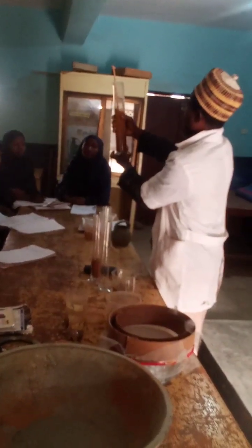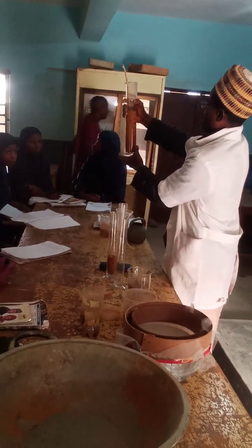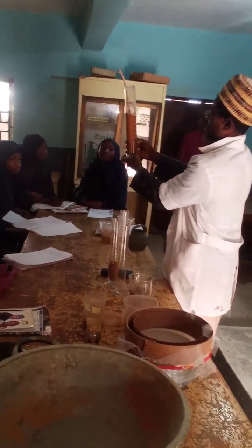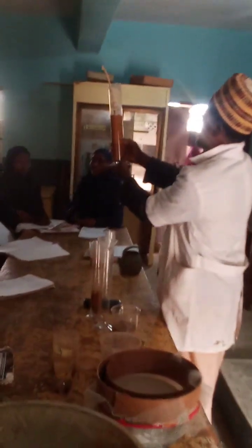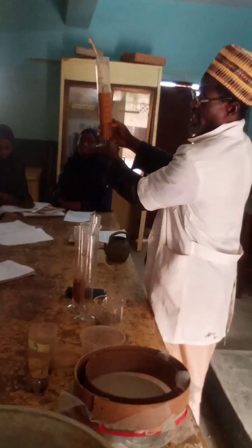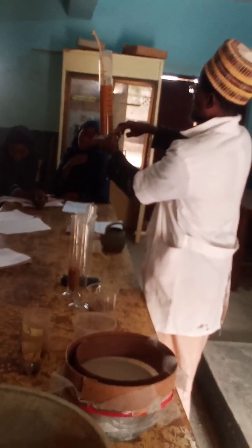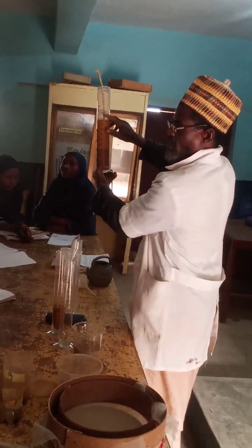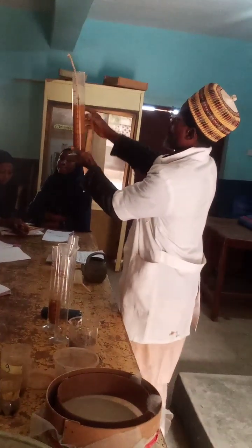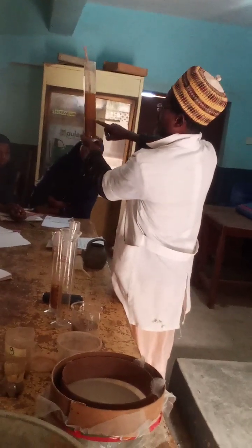If you look at this cylinder, the total height of the particles is somewhere around 160 mil. These cylinders range from 0 to 500 mil. So we now look at where the particles settled, from the bottom up to this place.